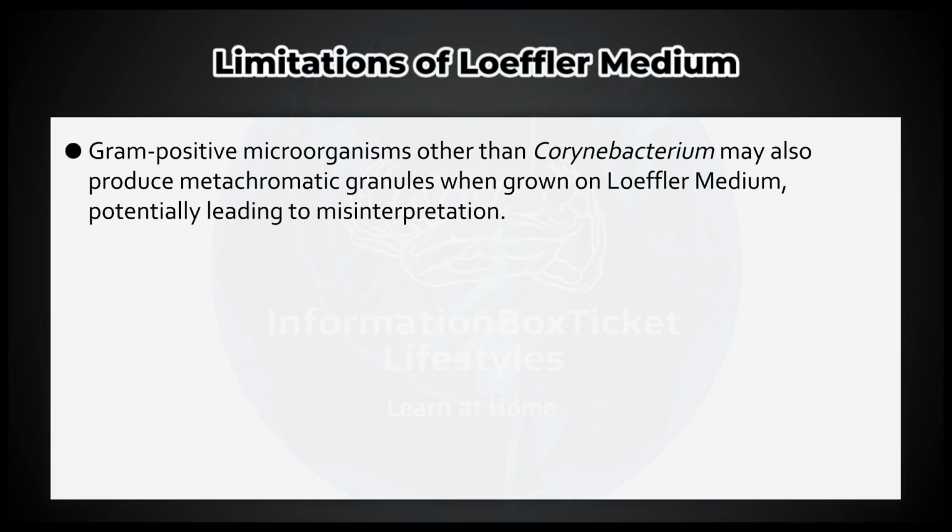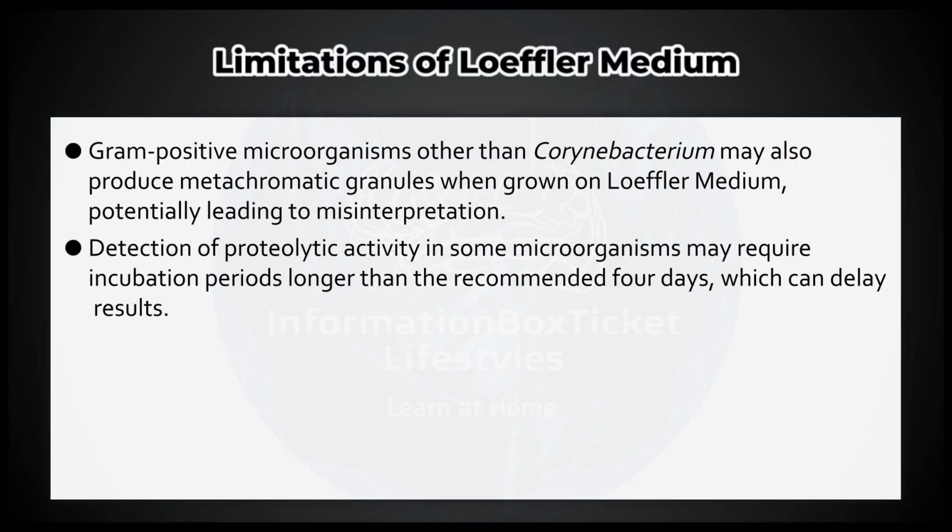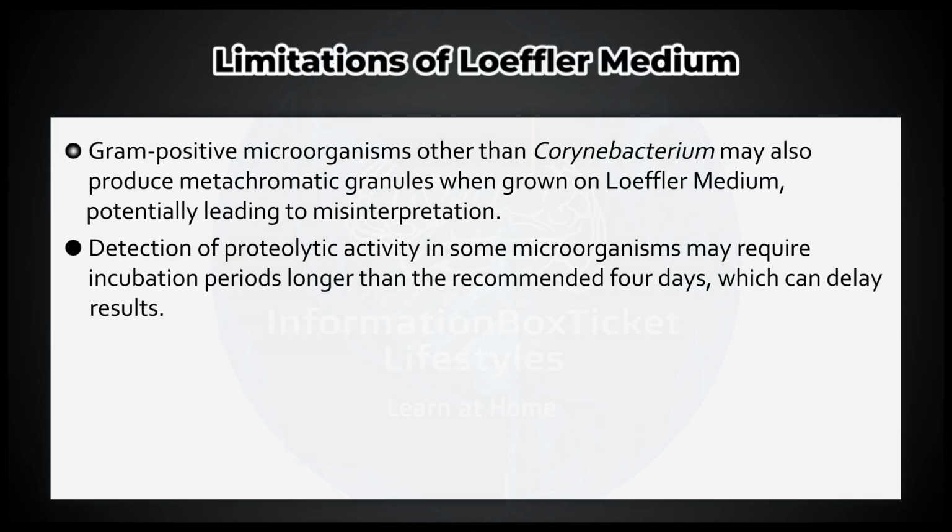Gram-positive microorganisms other than Corynebacterium may also produce metachromatic granules when grown on Loeffler medium, potentially leading to misinterpretation. Detection of proteolytic activity in some microorganisms may require incubation periods longer than the recommended 4 days, which can delay results.